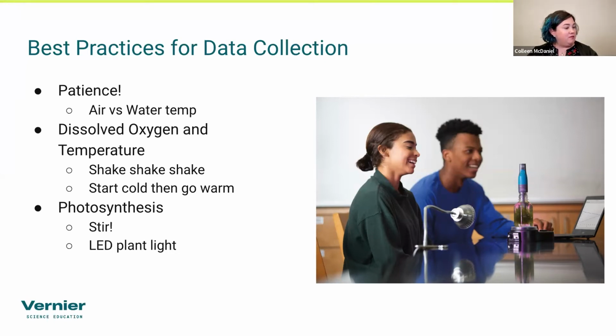Can I use it with marine green blue crabs? Yes. On the Go Direct dissolved oxygen probe, we have a DO salinity channel. That means it has an equation in there, because the amount of dissolved oxygen isn't as clean and cut in salt water as it is in fresh water.